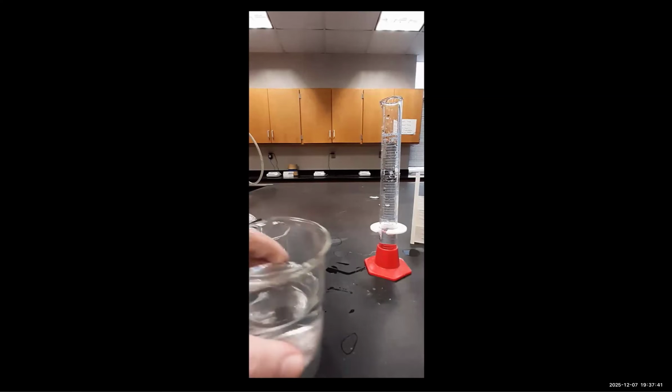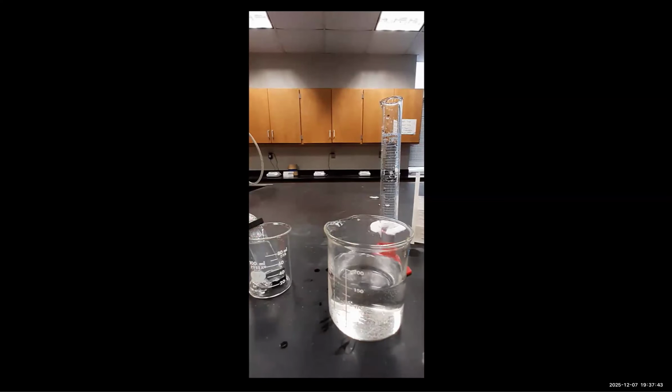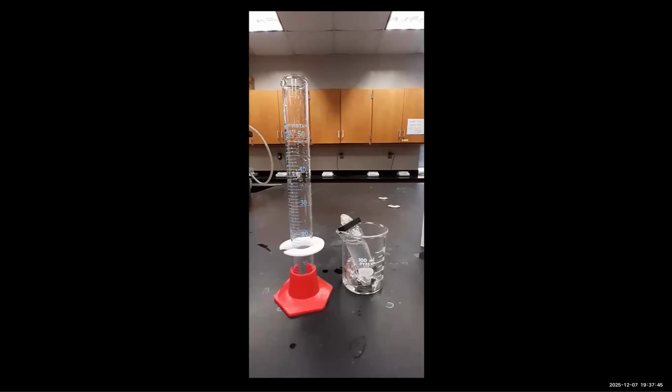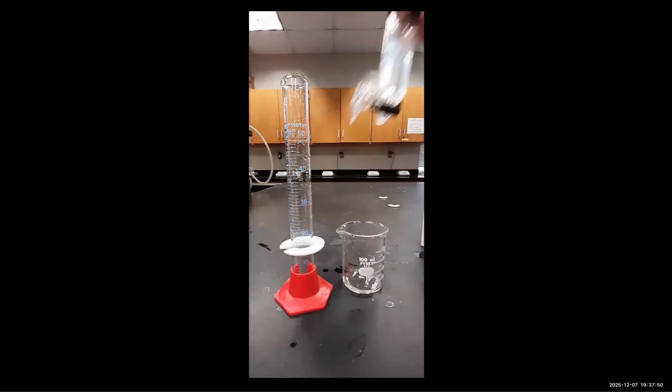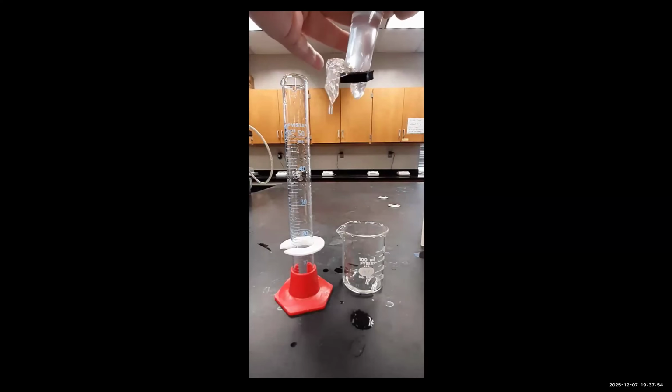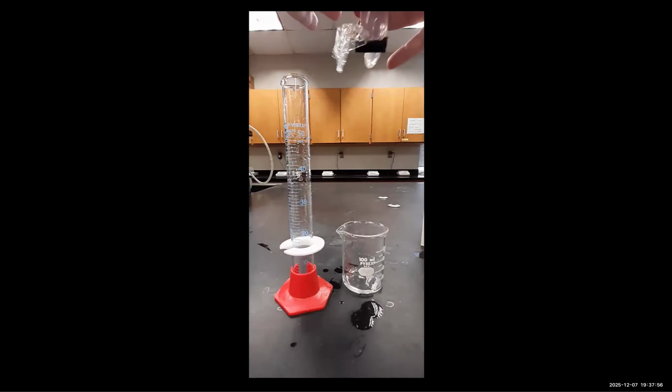So remember, as dialysis has been allowed to occur, some solution components have passed through the dialysis bag and into this beaker water. We're also now taking the water inside the dialysis bag and we're going to test that as well.